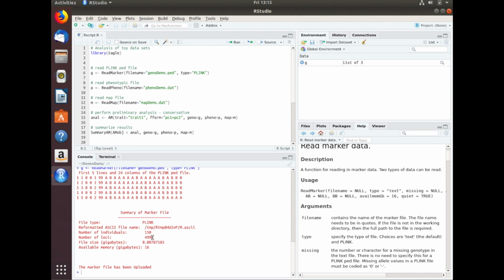They're two very important bits that can save you a lot of grief later on. But other than that, you can probably ignore everything else.